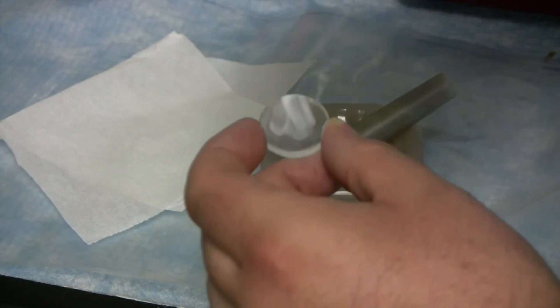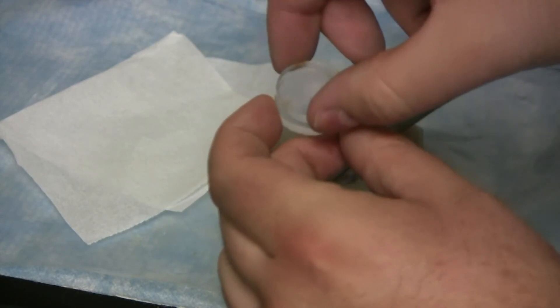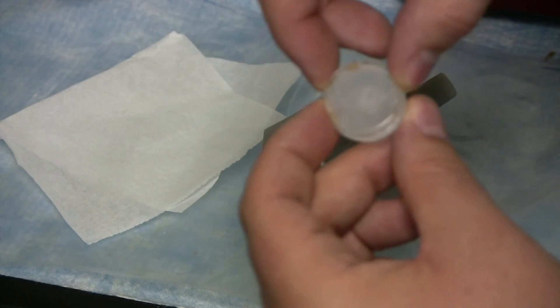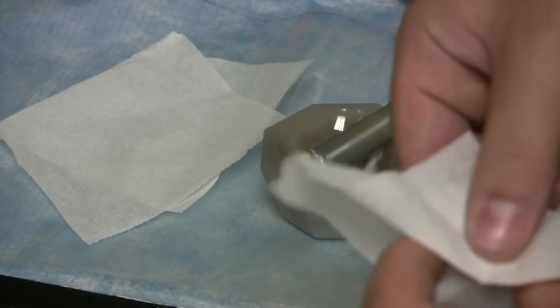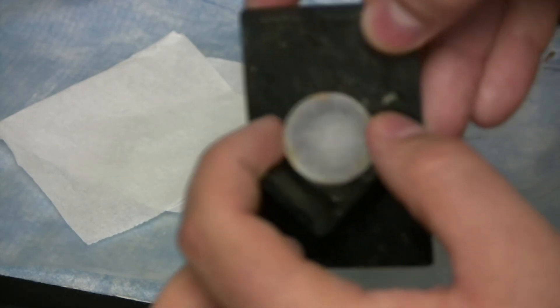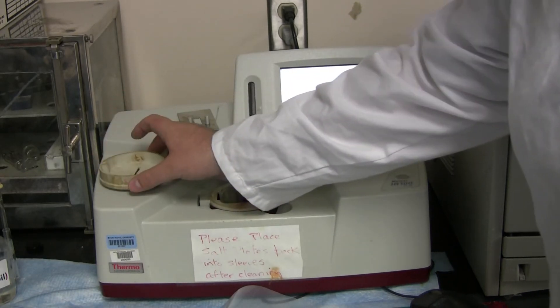Take the other salt plate and place it on top, and smear it back and forth to form a thin layer of your sample. Again, if you touch one of the faces, make sure to clean the top and bottom with a kimwipe. Now place this into a slide and place the slide into the Nicolette machine.